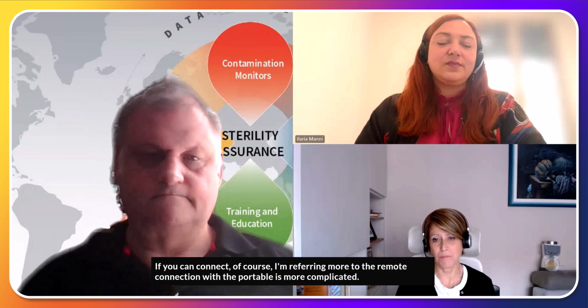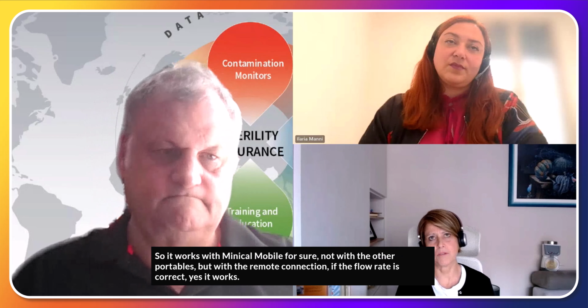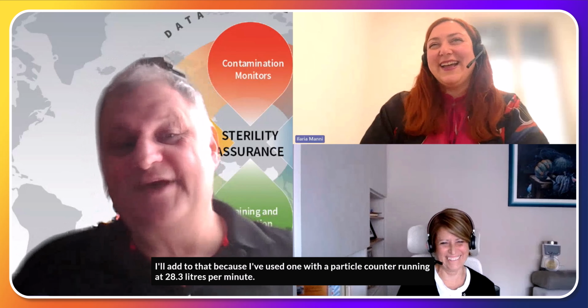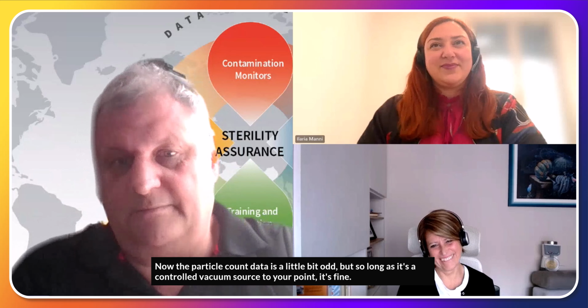I'm referring more to the remote connection. With the portable it is more complicated. So it works with Minican Mobile for sure, not with the other portables, but with the remote connection, if the flow rate is correct, yes, it works. Yeah, even ours is better. Yeah. I'll add to that because I've used one with a particle counter running at 28.3 liters per minute. Now the particle count data is a little bit odd, but so long as it's a controlled vacuum source, to your point, Julia, it's fine. Yeah, exactly. Good. This is the point.